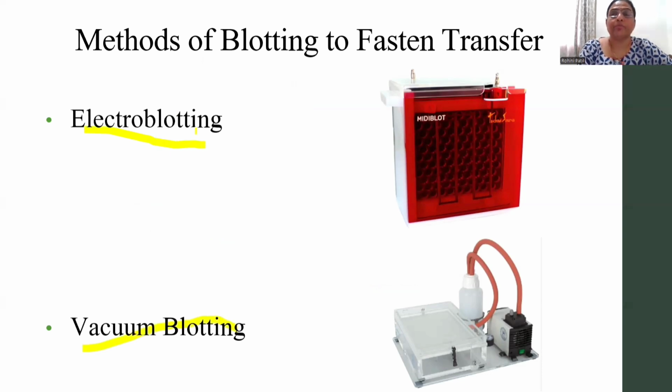Now, in electroblotting, this type of apparatus is used.